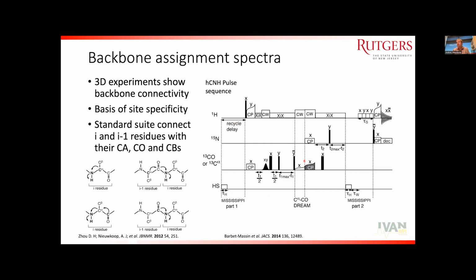You need really long T2s, and in solution NMR to do J-based transfers, solution NMR does all these transfers with scalar-based transfers, whereas the dipolar transfers work a little bit better when things are not as ideal, which as we push into more and more real, quote-unquote, systems, we actually spend a lot of time in the not ideal case. Anyway, then we suppress our water.